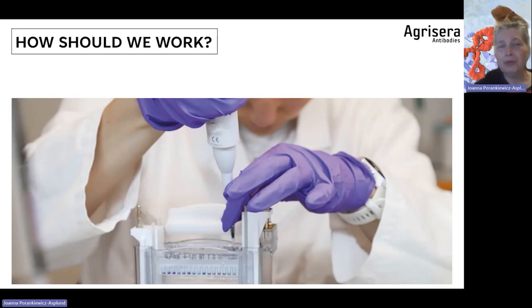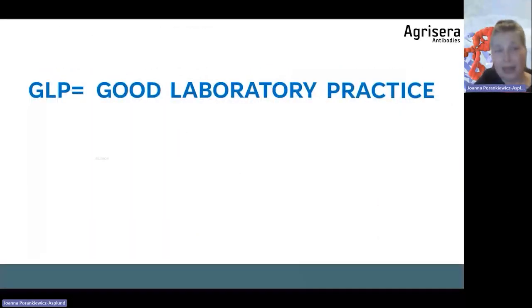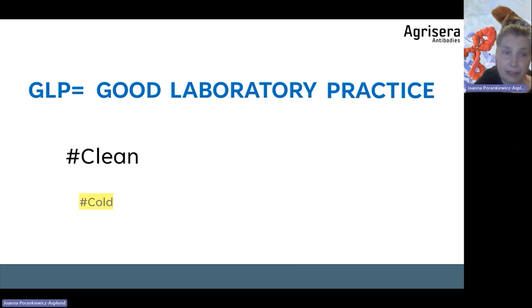How should we work with Western blot? Maybe you know the GLP rule and what it means — good laboratory practice. Good laboratory practice means that we're working clean. You need to clean the whole equipment very well, very thoroughly.